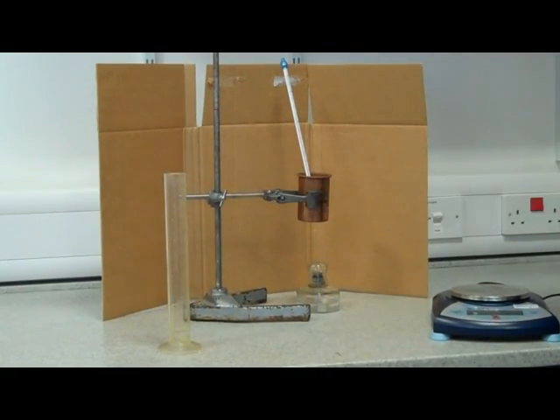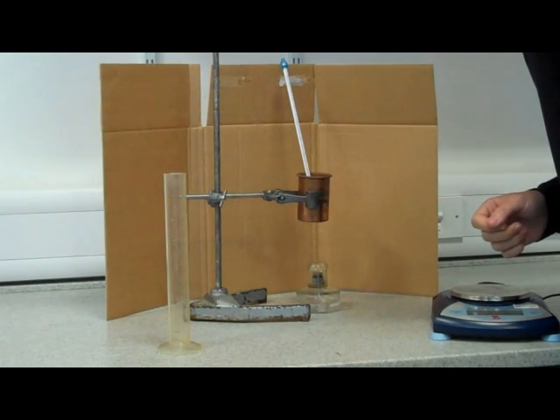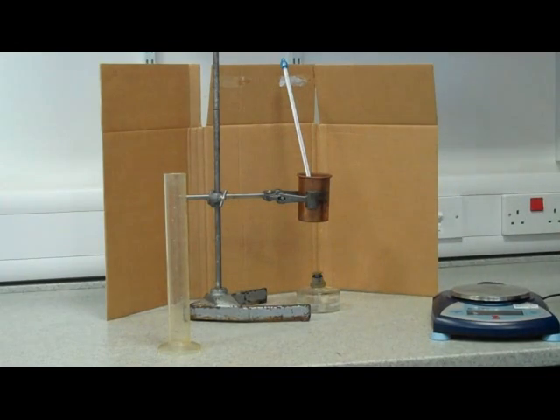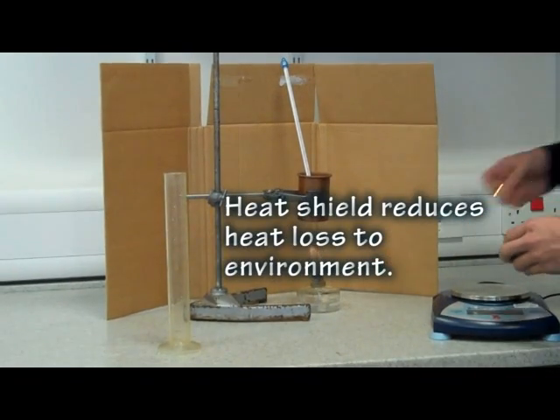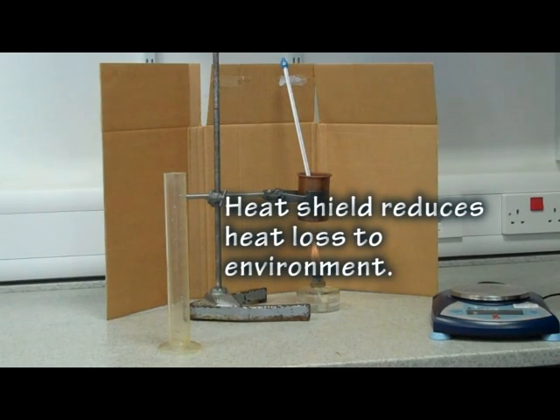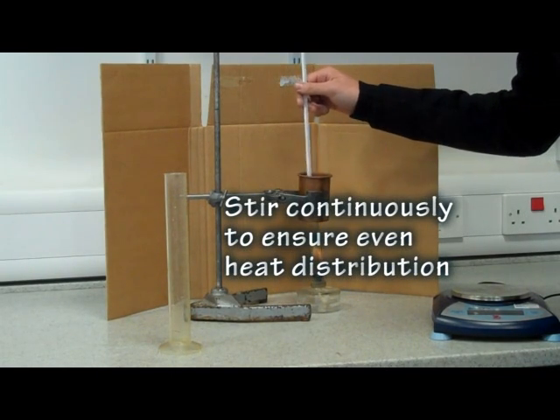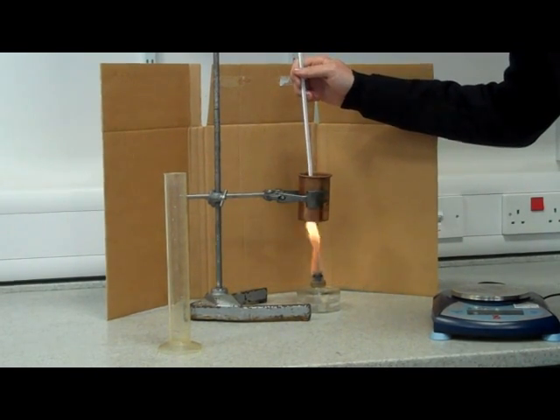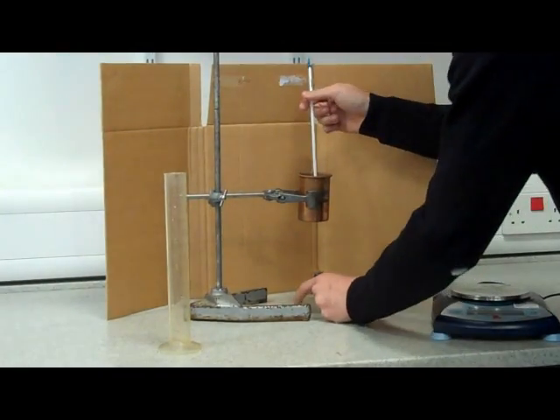We wait until the temperature settles, then record a start temperature. We then light the spirit burner. A heat shield is used to stop some heat being lost into the environment. We continue the experiment without the thermometer touching the bottom of the can to ensure an even heat distribution. When the desired temperature is reached, you blow out the burner and wait until the thermometer has reached its maximum temperature.